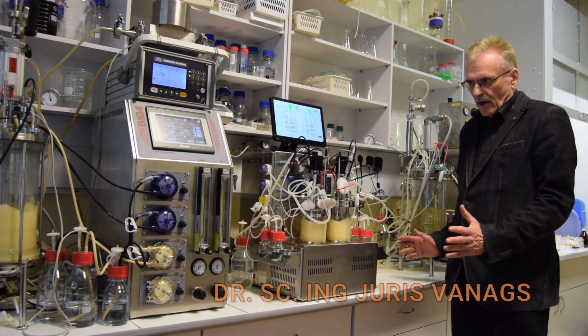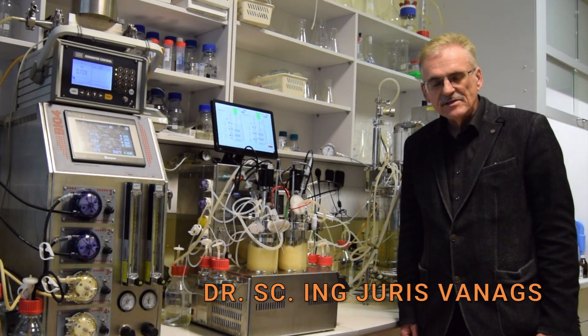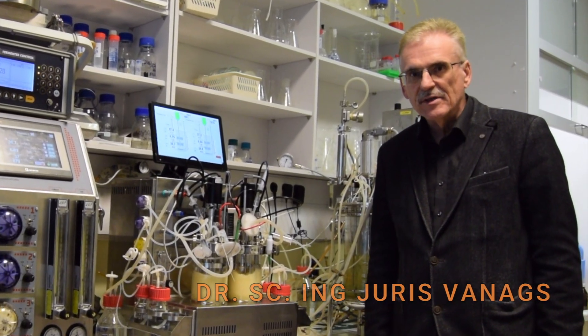This is our laboratory bioreactor testing room. We test here bioreactors in real fermentations.